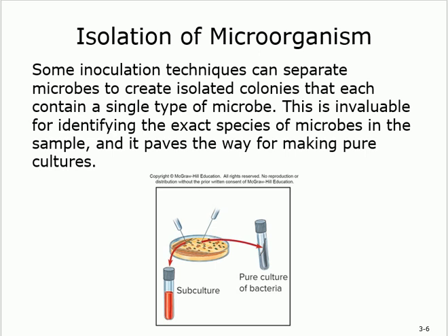You inoculate, and this is not easy to do. It's kind of complicated to get one organism and put it in the medium and allow it to grow, and this is the only one that you see. This is called a pure culture, which is not that easy. Most of the time, you have a mix, and you need to isolate. So far, we didn't need to isolate, right? It is already a pure culture. Did we get what a pure culture is? One species only, already isolated. You don't have to isolate.